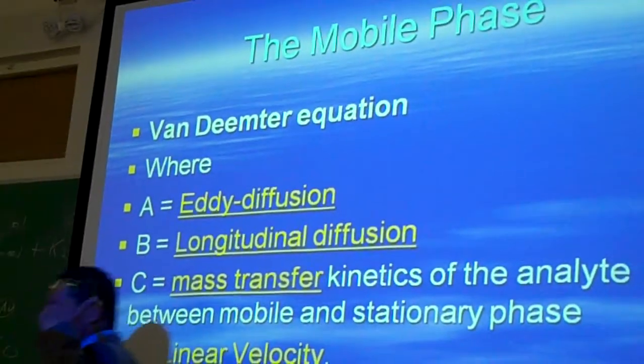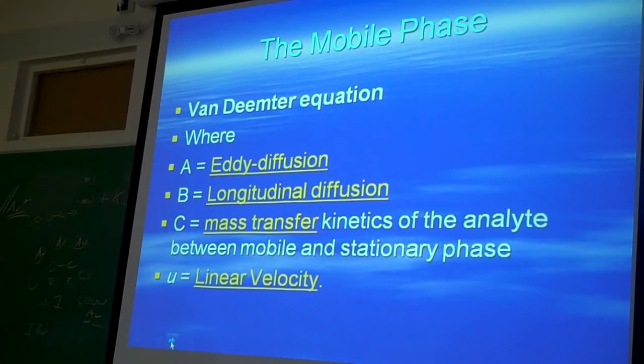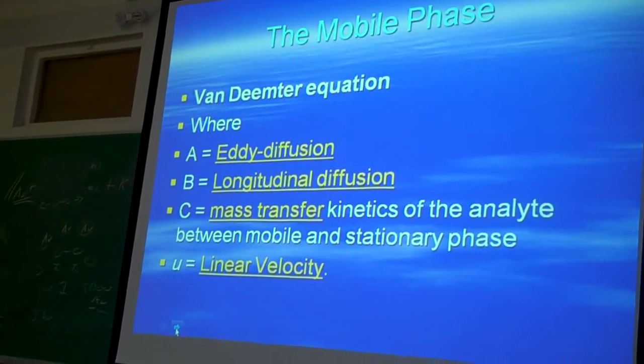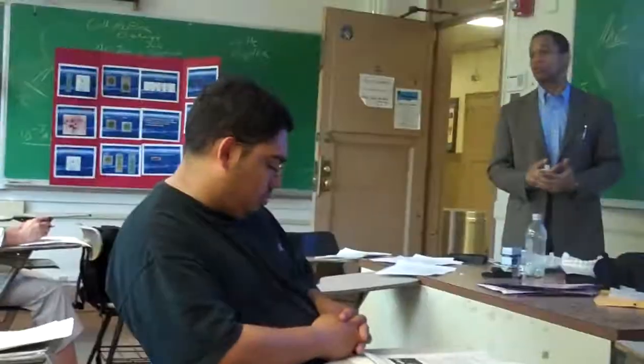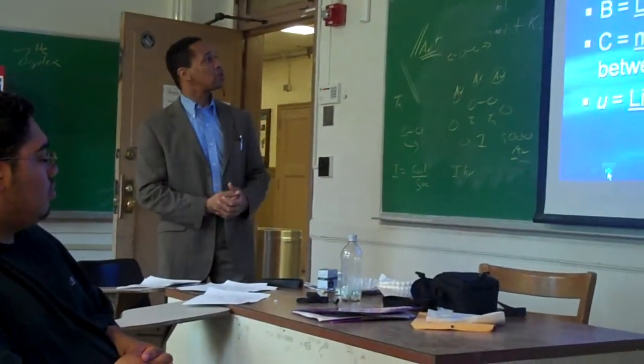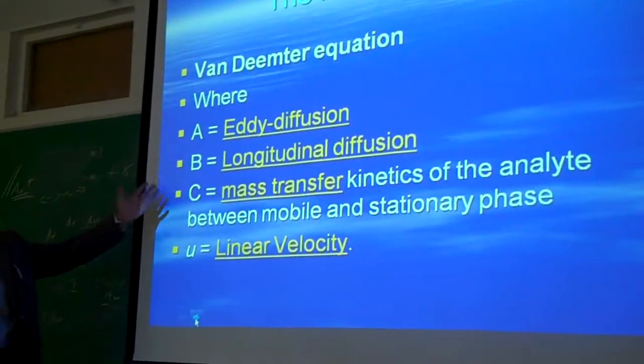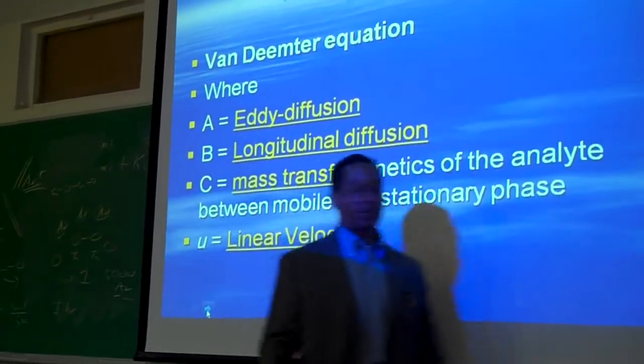These are also some terms that you would apply to the mobile phase, where scientists have computer calculations to see how the mobile phase behaves. Why so much? A lot of this is used in the pharmaceutical industry, to separate pharmaceuticals. And these are some terms that might go into a computer calculation of a mobile phase.